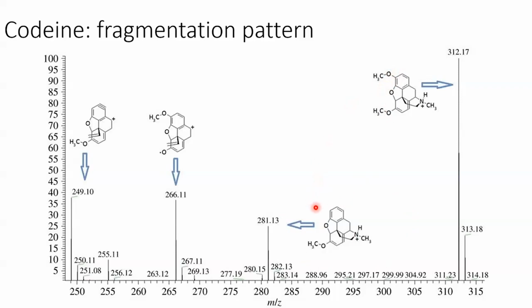So this is the point where the fragmentation has occurred. I think it fragments in other areas as well, but that's the one we're going to focus on. Going a little bit further, we can see that here we have a nitrogen group shown here. That is one of the fragmentation points, whereby this entire group flies off the molecule. We also note that there is a fragmentation point between the methyl group and the oxygen shown here.